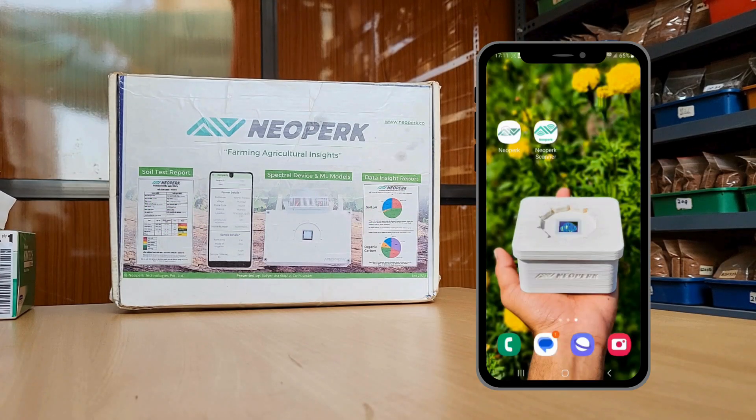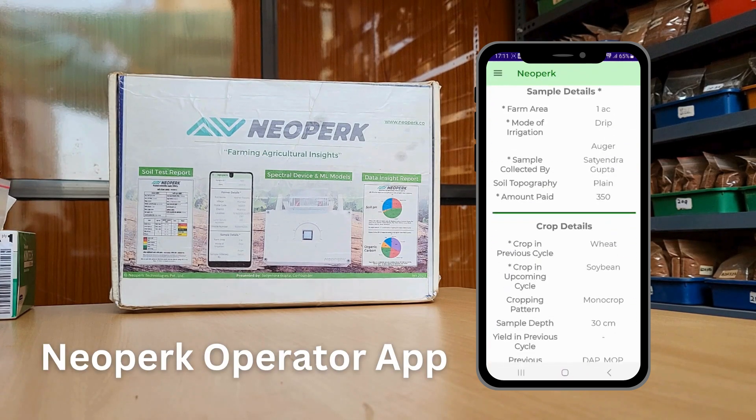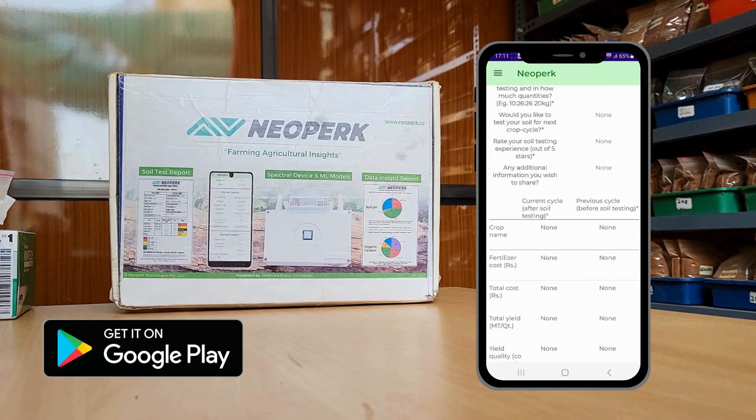The first step is to collect farmer, sample, and farm level data using Neopark Operator app, also available on Google Play Store.